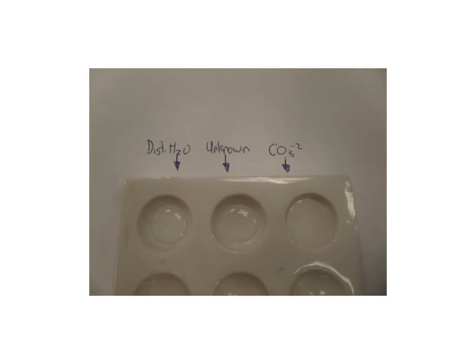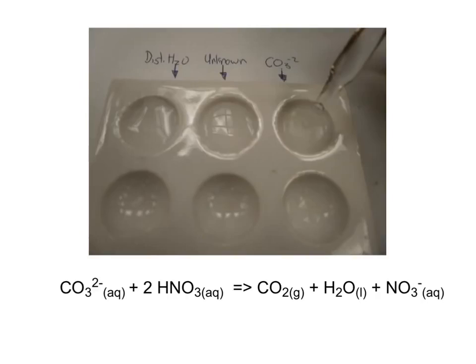This is how it looks when all 3 spots are filled, and they should contain the same amount of liquid. And it looks like somebody has filled a little bit too much of the solution known to contain carbonate ions here in the third spot. We now add 3 drops of nitric acid to each of the 3 spots.